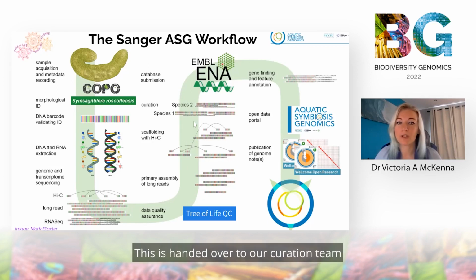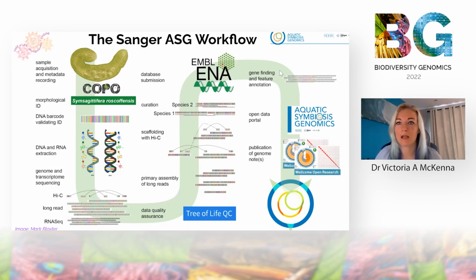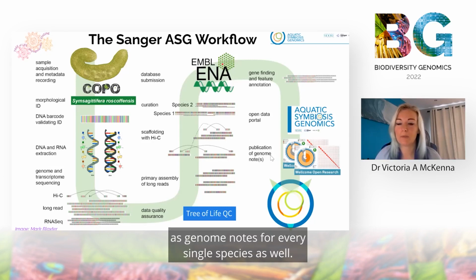This is handed over to our curation team, who carry out the curation manually. Annotation isn't yet happening in the ASG team, but once that happens, it will be submitted as well along with the curation. All of this is submitted to the EMBL ENA database and the data portal too. We have our own Aquatic Symbiosis Genomics data portal provided by EMBL-EBI, which helps us track the status of each species and where it is in the pipeline. All of this is published in the Wellcome Open Research portal as genome notes for every single species as well.